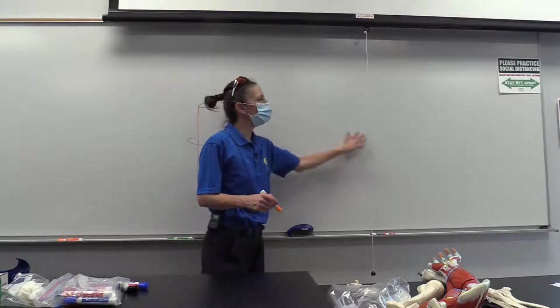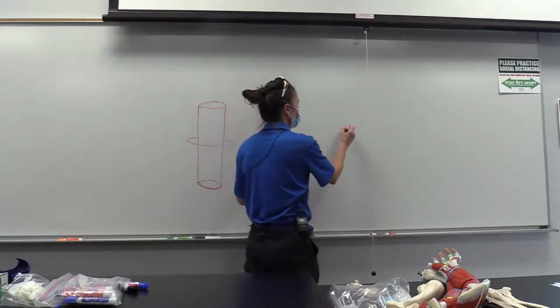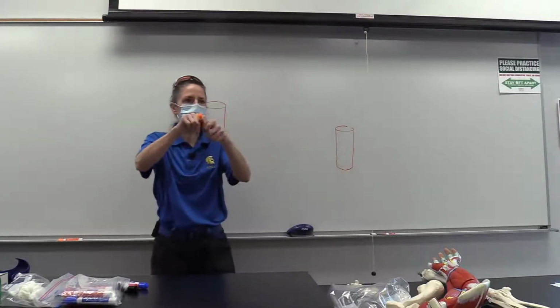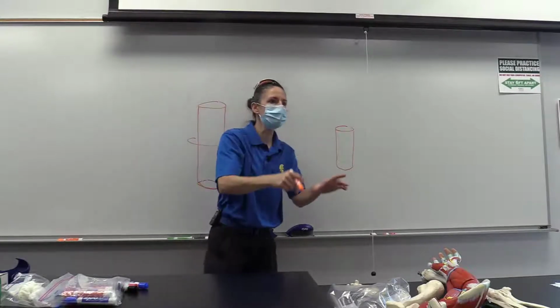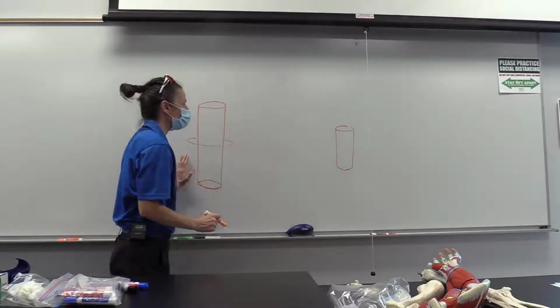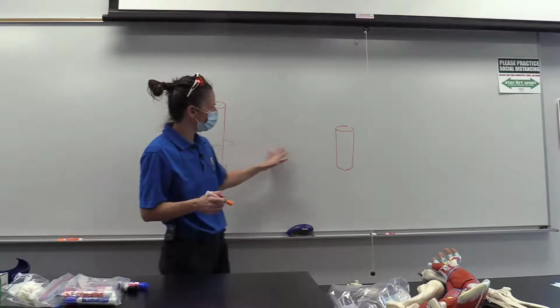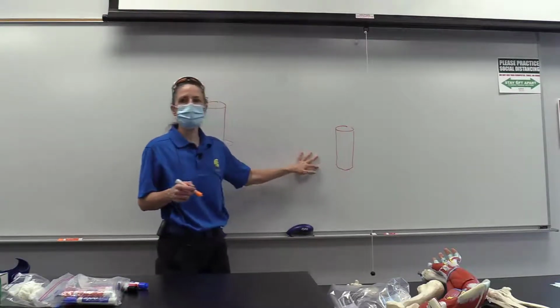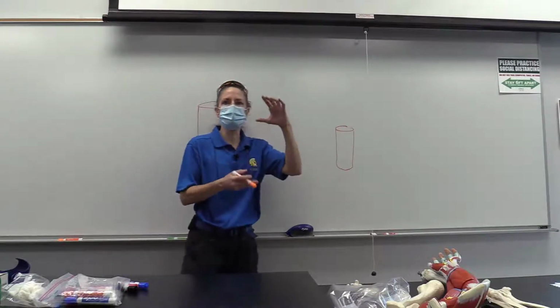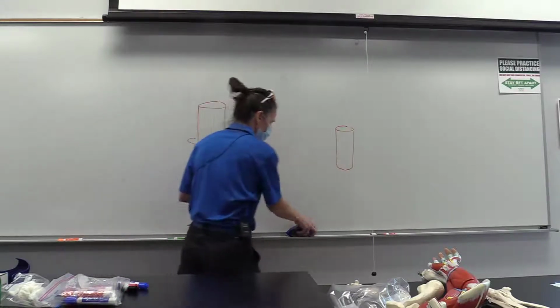Very similar to what's going on with the hypertonic solution with the potato cores. They will shrink, and not only will they shrink, but they'll get really bendy. We call this flaccid. They get flaccid and bendy. So they shrink and they get bendy, whereas the ones that were in hypotonic solution, they grew and they got rigid. The other thing is somewhere along the way, there was a solution that was very close to isotonic, and you didn't see much change in the potato core. So that's another thing to be aware of with this experiment.